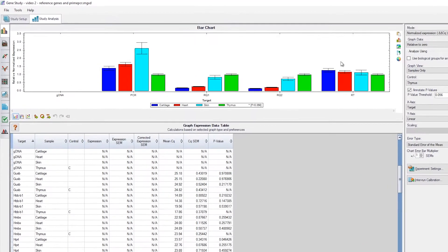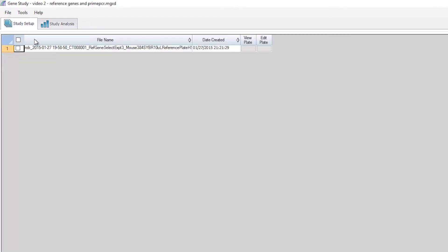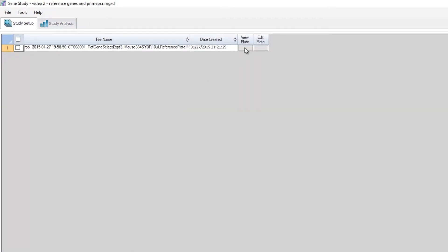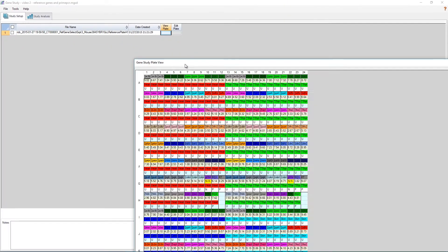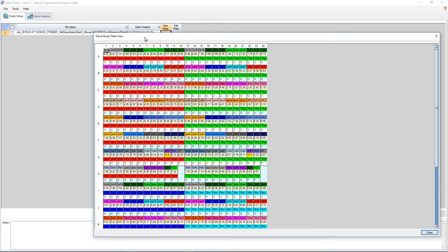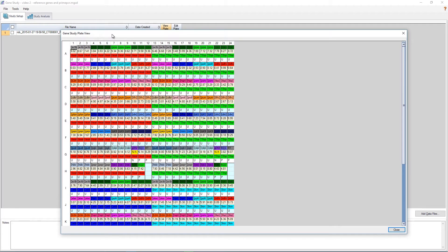In this example, we're going to look at a Gene Study we've already created and we'll be analyzing the results from a single run. In this case, we used a 384-well PrimePCR reference gene array plate that lets us compare the stability of 30 genes in 4 samples.